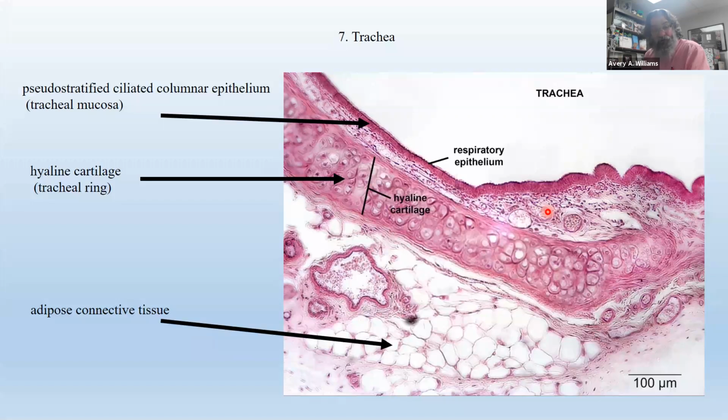And it is also true that pseudostratified does not have to be ciliated. But again, in my class, you won't see non-ciliated pseudostratified. There are only two places in your body where you can see that, the male urethra and the eustachian tubes. We don't look at either of those two, so you don't have to worry about that. So the bottom line is, if you see cilia, you're looking at PCC. And if you're looking at PCC, it's in the respiratory system somewhere.